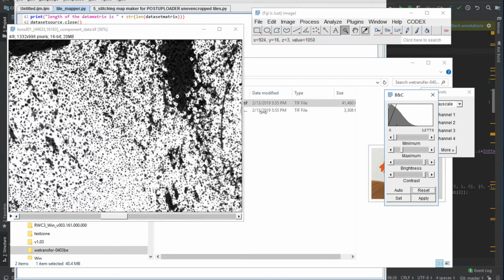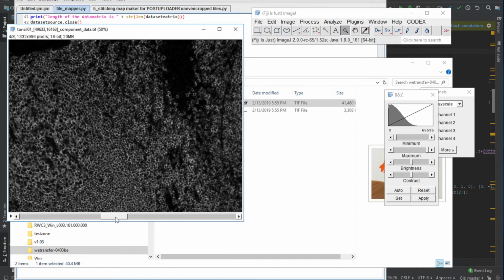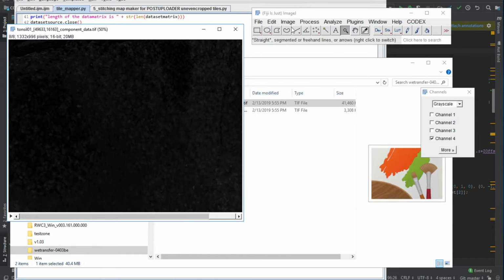Okay, Shift-C. Oh, that's good. Now everything is fine. Oh yeah, everything is good now. So your CD45 looks good. It is not overexposed. Very good. So let's just repeat the whole thing, and I will go very fast.